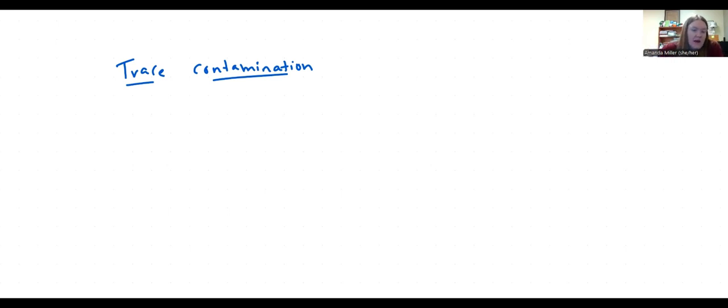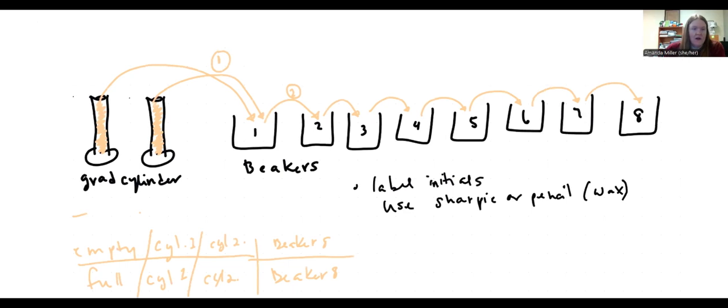So we'll have our 8 beakers from the last experiment that all have a small amount of material in them. Beaker 8 has a lot of material in it. That one we're not going to add anything to because this goes into a recycling container that we have labeled, I think, brown stuff or maybe orange stuff.